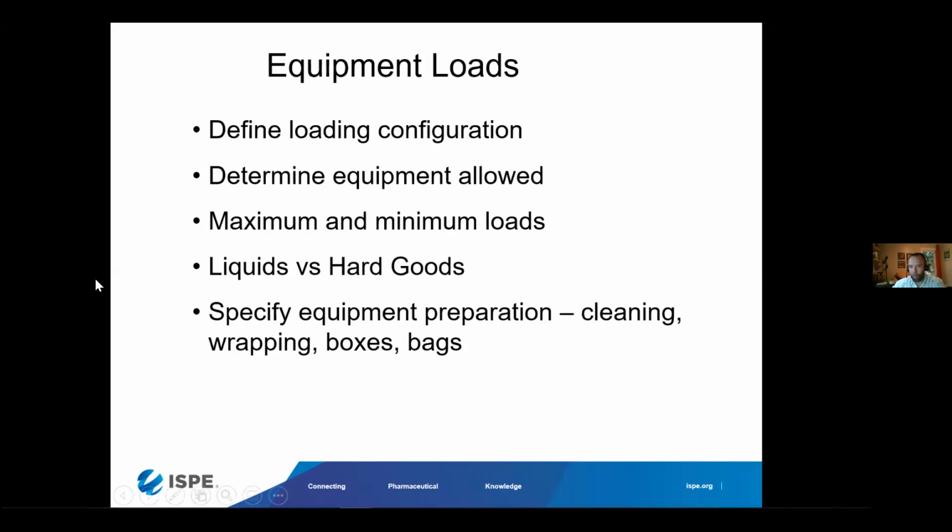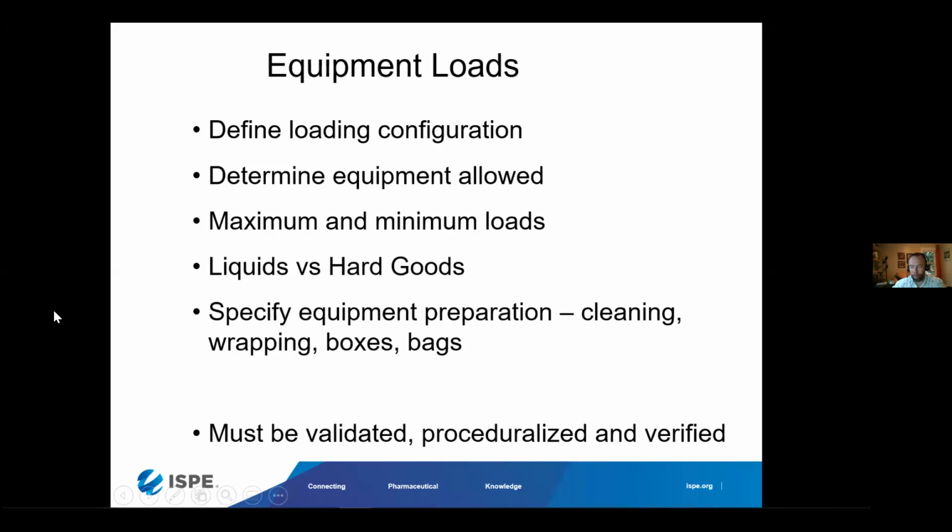So we're going to spend a couple minutes now on this equipment preparation with regards to the sterilization wrapping, as it's critical in the validation and the routine procedure and verification. So the biological indicators, the autoclave parameters, but also how we're preparing the equipment for sterilization.